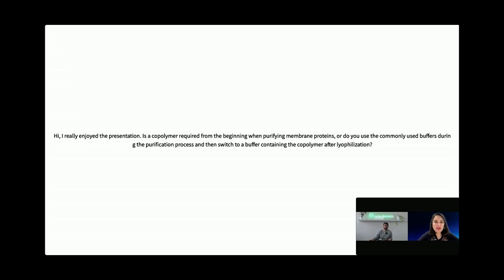Yeah, and I think you even have developed a protocol for the purification steps. This is also something that people can find on the Cube website, and there is even a step in the protocol to, for example, use the Prometheus Panta to also check the stability and that everything is in the right state how you want it.